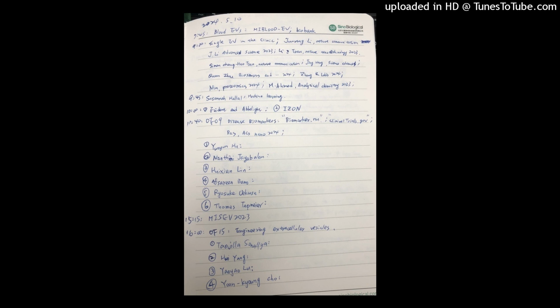Measure the concentration of platelets that is still present in the plasma, because it tells you something about the efficacy of the centrifugation procedure as such. It tells you something about, did the protocol perform correctly? If there's a high concentration of platelets left, you know it's a confounder because it's difficult to separate from the vesicles, etc.